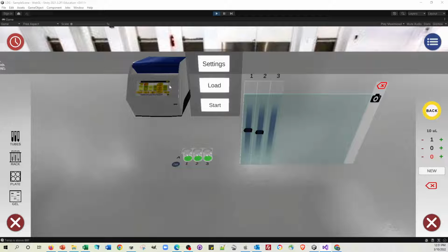And that is not just for the PCR machine, that's also for the gel running, because we have to be able to pick up every single species that might be in this track and produce a band of the right density to reflect the quantity that there is. And we also want to start changing the background of this as well.